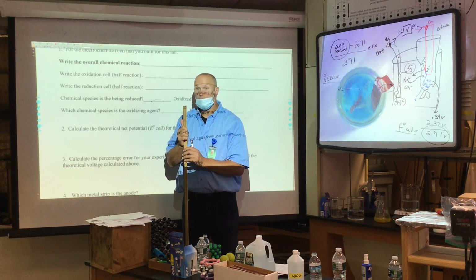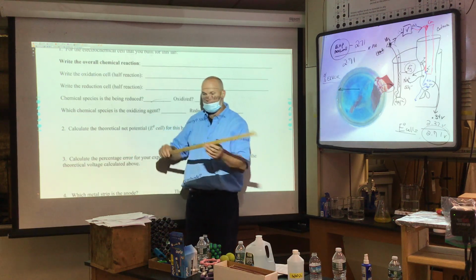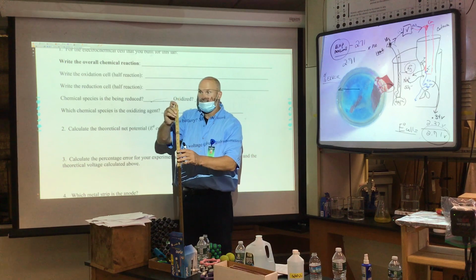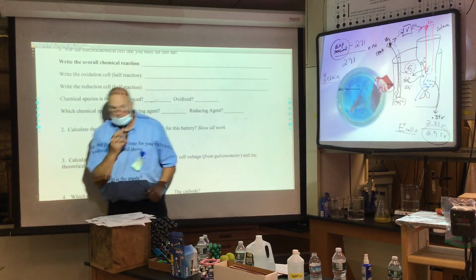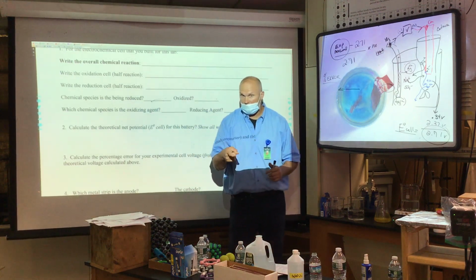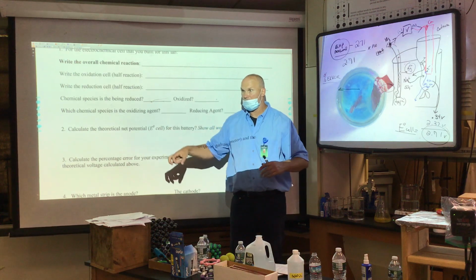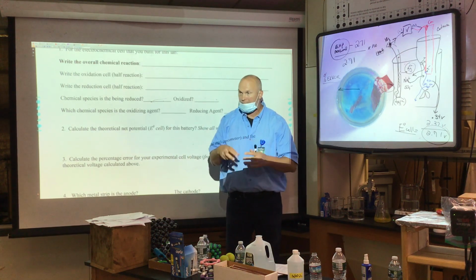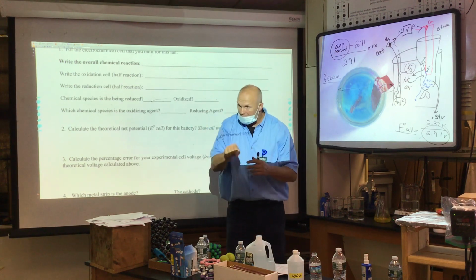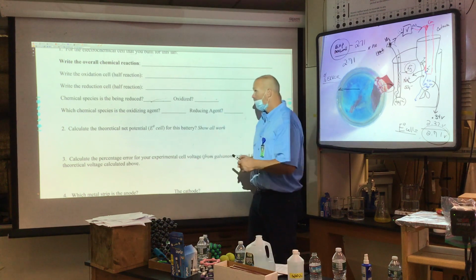It's basically a noble metal. It doesn't react, won't rust, won't chip, okay? And of course it's not going to warp like wood. So how close this is to the actual meter is accuracy. Over time, these lose their accuracy. In fact, a lot of measurement devices lose their accuracy over time. That's why you have to recalibrate them. The electric scales that we'll be using in lab, over time they lose their calibration. I have to recalibrate it, put a known weight on them, and then type in, hey, that's 10 grams. Okay? So all that stuff we talked about. All right.